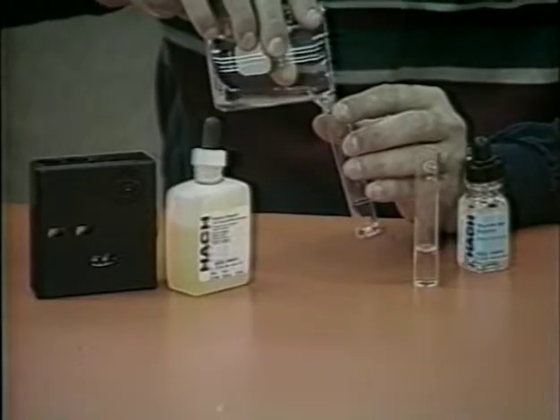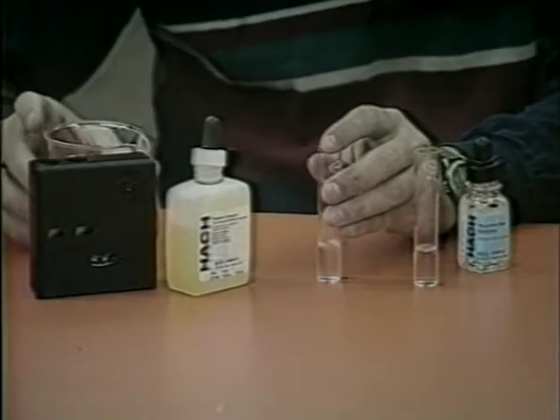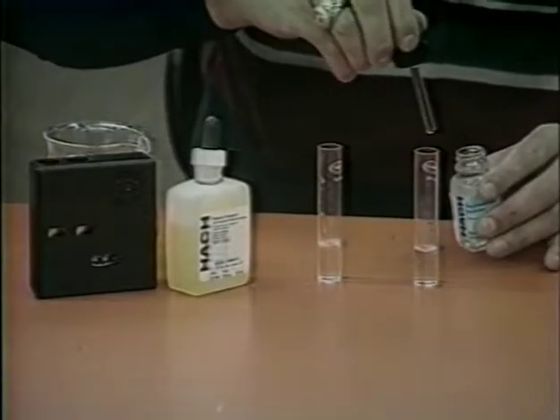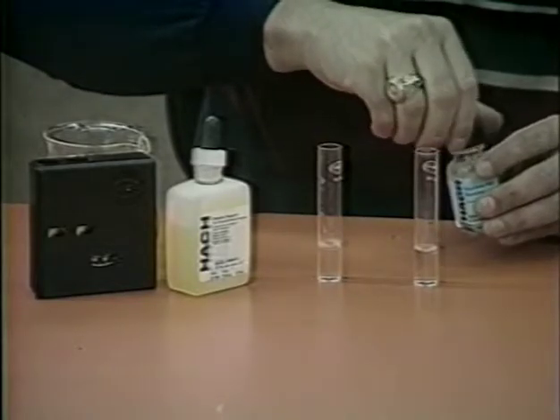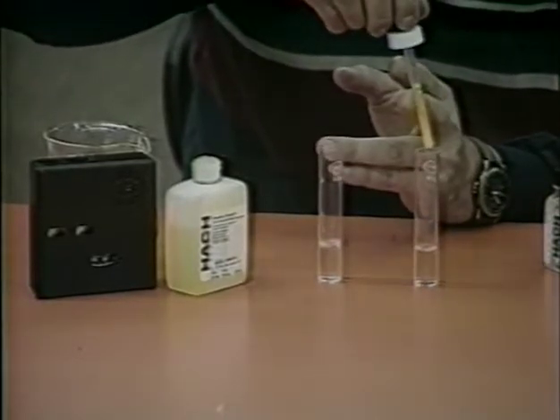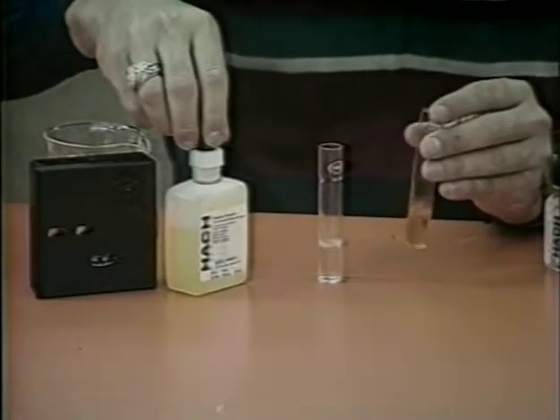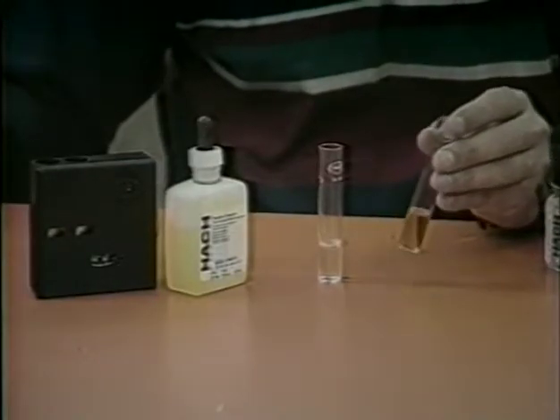Rinse and fill the 2 color viewing tubes to the 5 ml mark. Add 1 drop of Rochelle salt solution to one of the tubes if the total hardness is above 100 milligrams per liter as calcium carbonate. Add 3 drops of Nessler's reagent to the same tube that the Rochelle salt solution was added. Swirl to mix for several seconds. Allow 10 minutes for the color development. If ammonia is present, a yellow color will be evident.